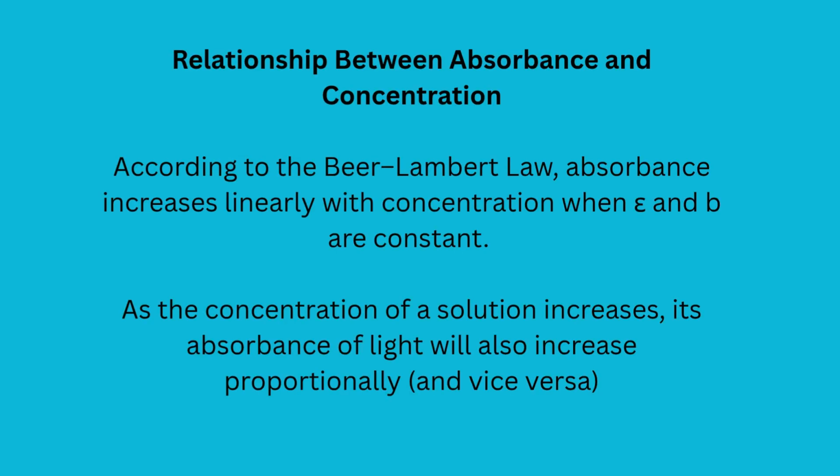According to the relationship between absorbance and concentration in the Beer-Lambert law, absorbance increases linearly with concentration when epsilon and L are constant.